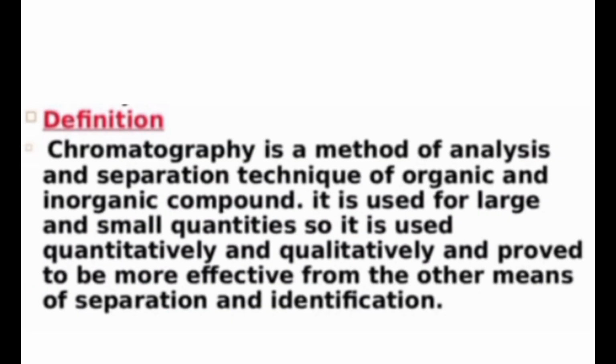The definition of chromatography is a method. It is a method to analyze and a separation technique for organic and inorganic compounds. It is used for large and small quantities, so it is used quantitatively and qualitatively, and proved to be more effective than other means of separation and identification.